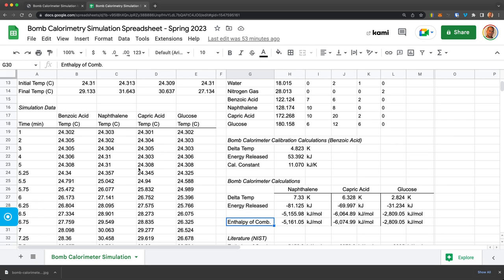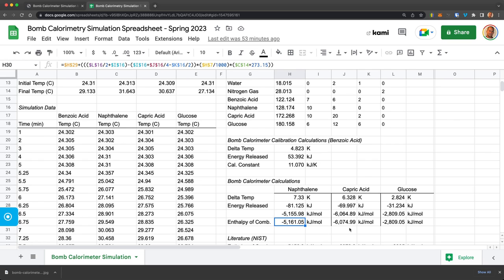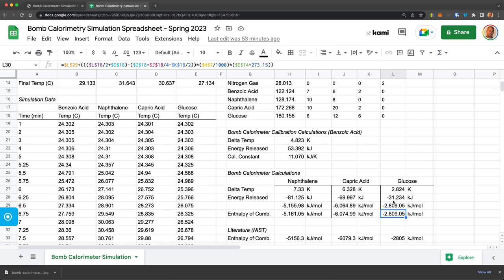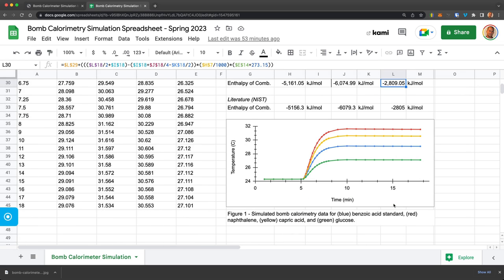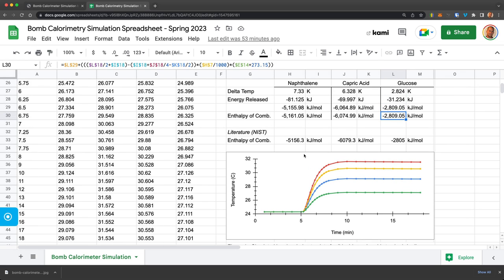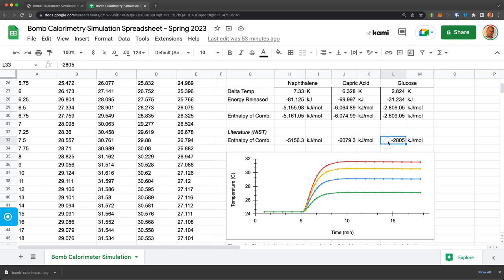And so I was able to, from this data and from that simulation, give me a calculated heat of combustion or the enthalpy of combustion for each of these three that I simulated. And then I can compare that to literature values from NIST and see how those compare.